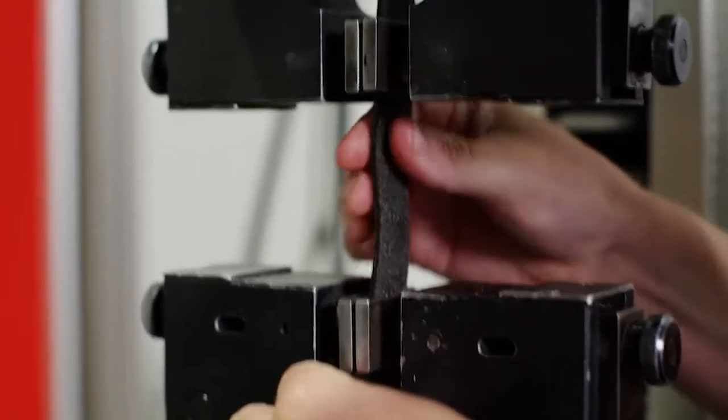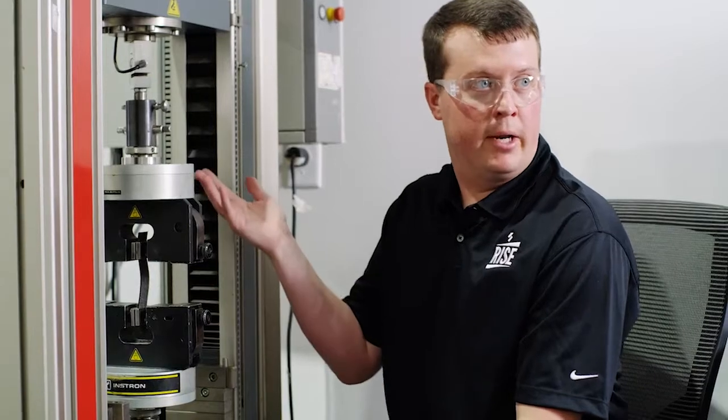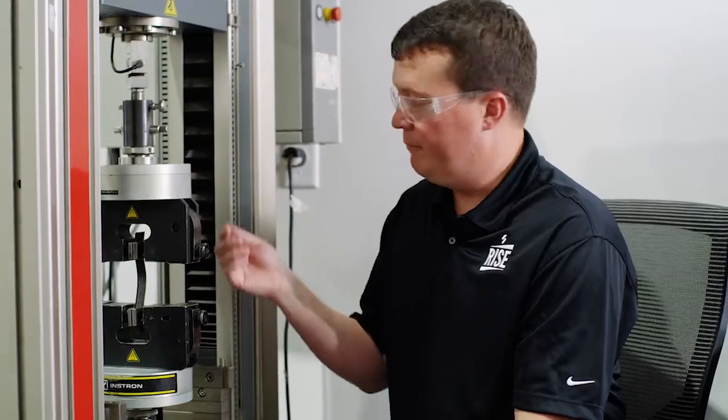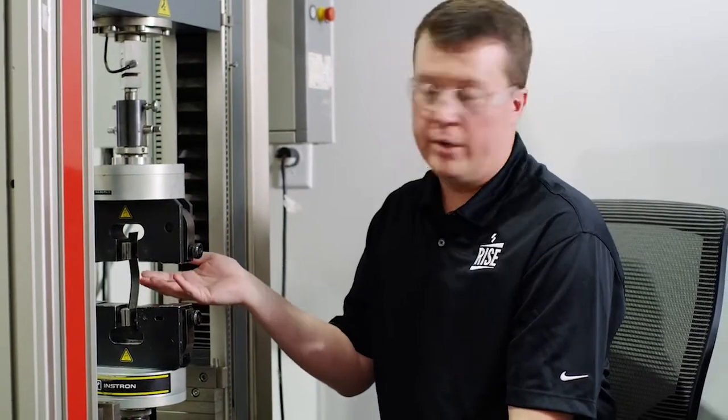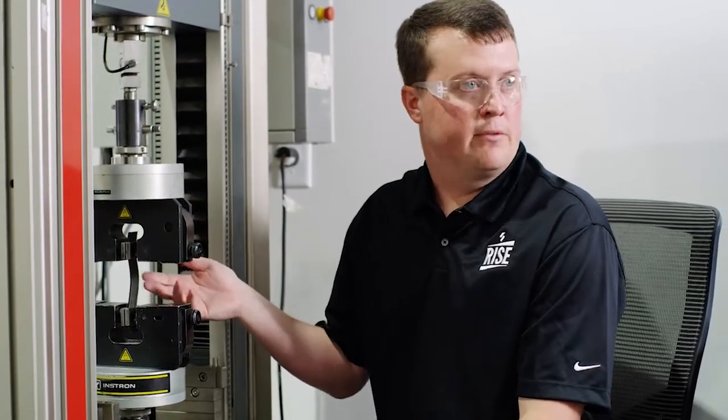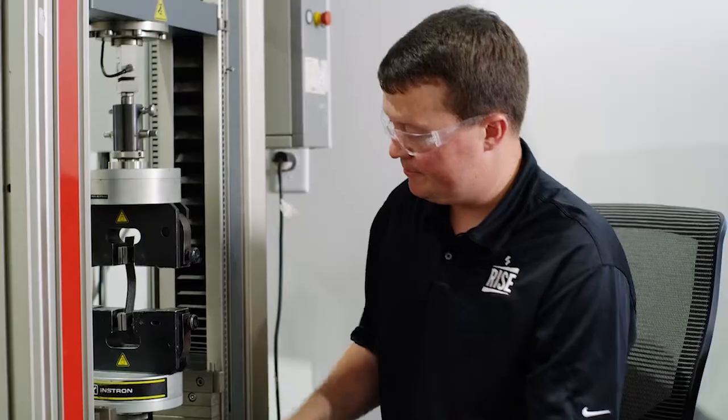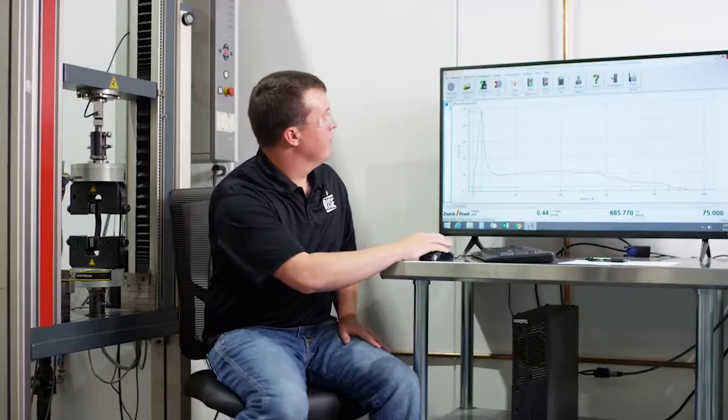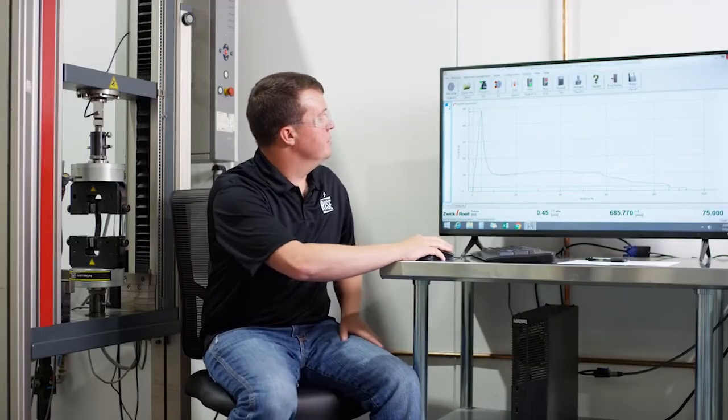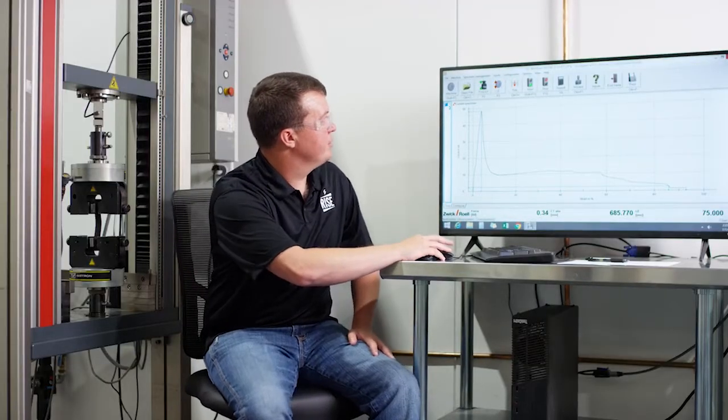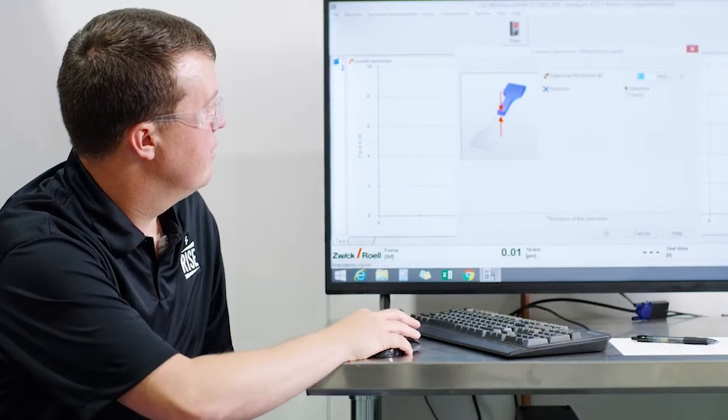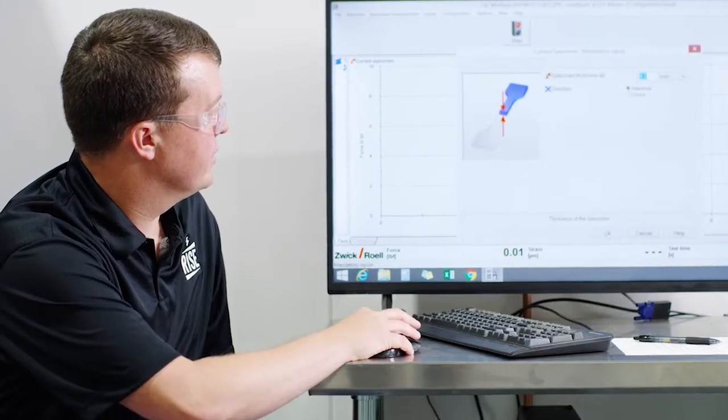When I start my test, these jaws will begin to separate at a predetermined speed. This is for ASTM D5147. So we're going to come over here, zero out our force and start the sample.